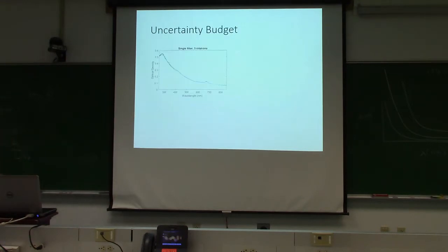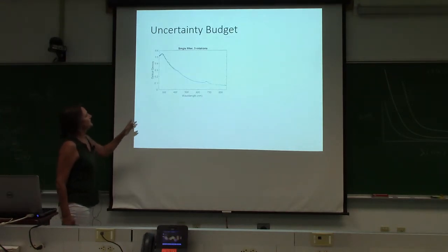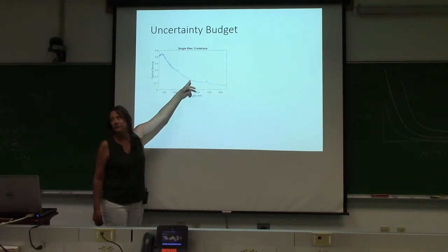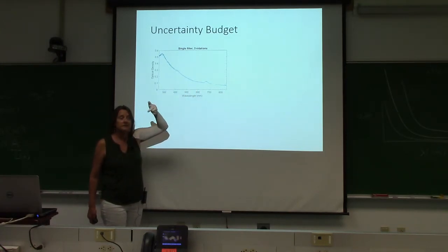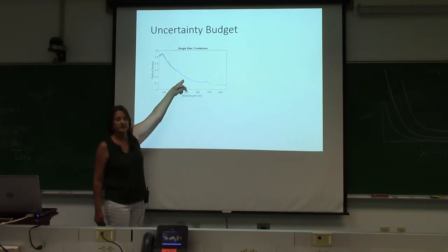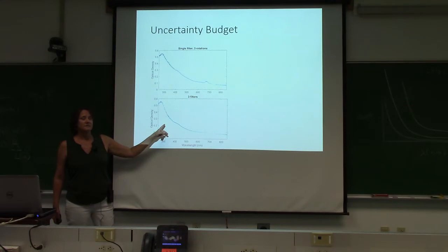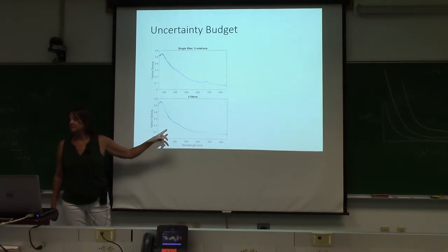Yeah, okay. So I would give you an example. Here's the optical density of a single filter pad rotated 3 ways. That is very good replication. Here are 3 different filters. That is very good filtering replication.